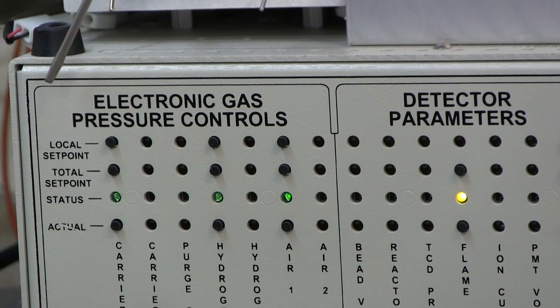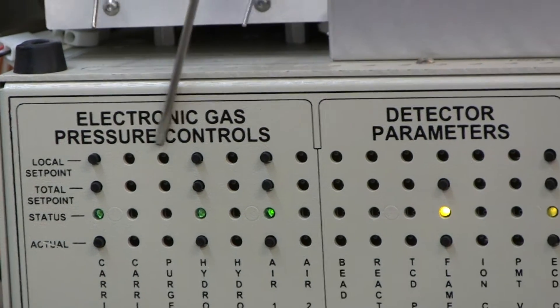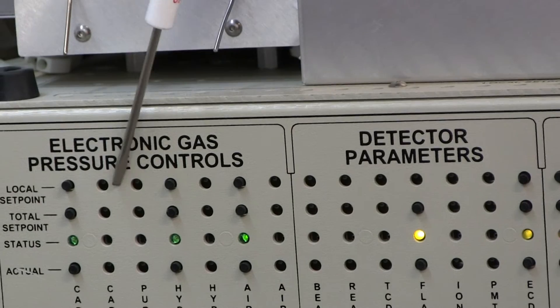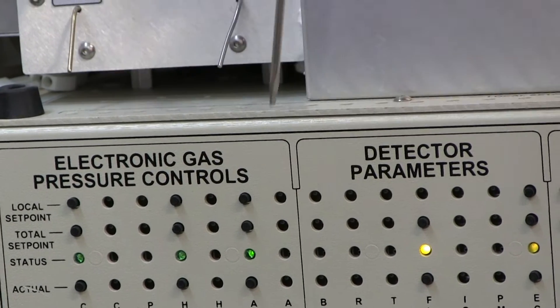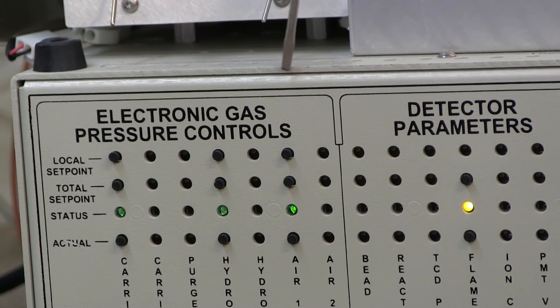The front panel is organized by all the gases in this section here. We can have up to 7 different gases controlled by the screwdriver adjustment to whatever pressure you'd like.